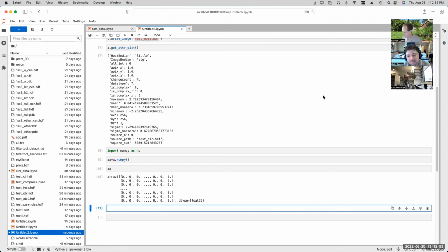Yeah, I think I get the idea, because EMAN2 will just assume it's the same thing as long as it has the same name. Well, the same is true of RELION or anything else that you want to use. If you've got your star file, which is referencing images in another file, you can just rename the folders basically, and you can produce the same sort of result. That's usually the most reliable way of handling that kind of thing in my experience.